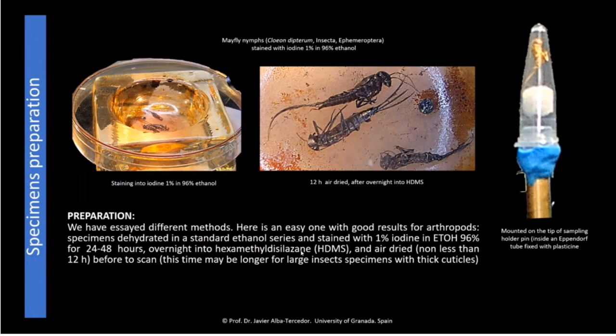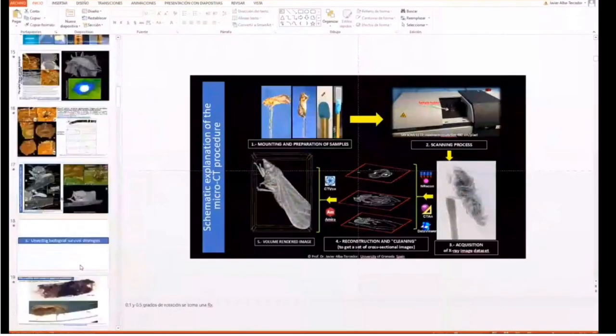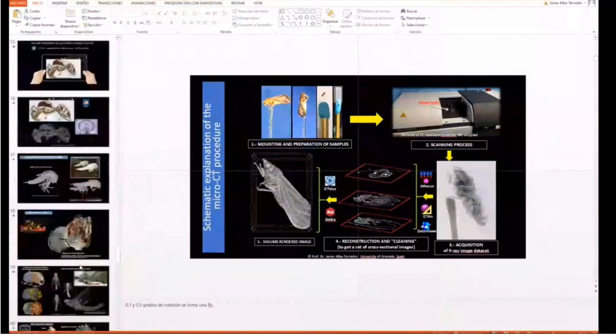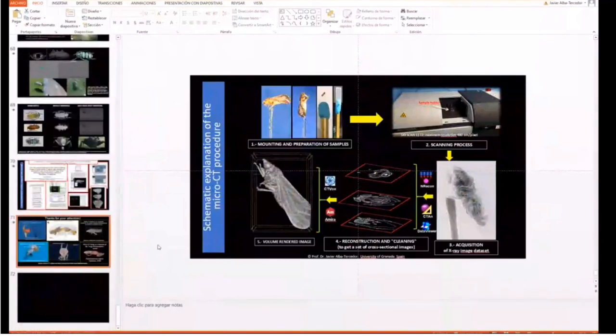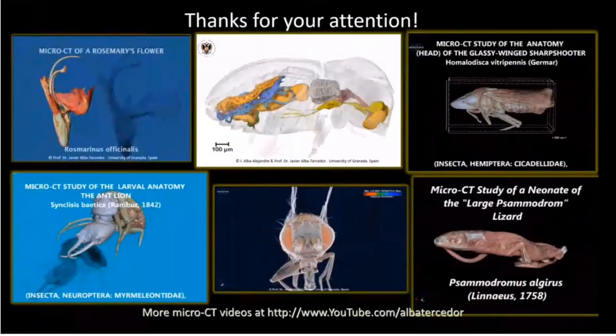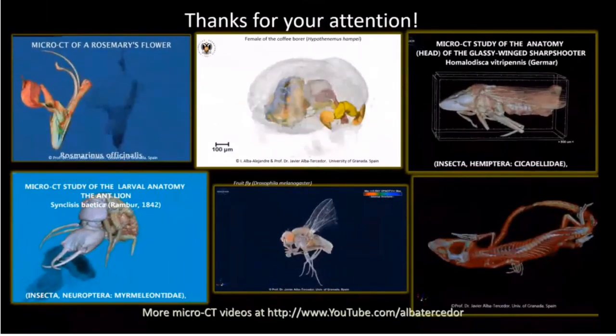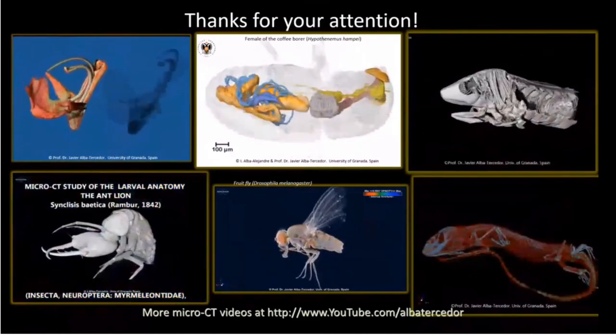Yes, it's up to companies and the research in this field. It depends on how fast the scanner can scan. Yes, I did it. If you go to my YouTube channel, you will see a fruit fly in there. I don't have the video here, sucking liquid with sugar with a contrast, so you can see how it's going through the intestine alive.